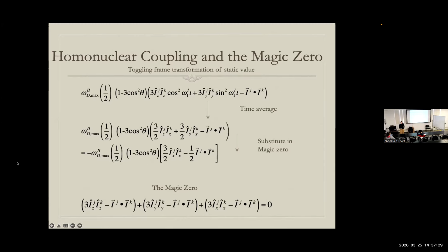So you have 1, 2, 3, maybe 4 spins that all recouple. But when you go to many, when you go to Avogadro's number, it behaves dissipatively. And why? What's happening there? You lose into the larger network of spins things that don't fully recouple in the second half of the rotor cycle, if you think about the slow spinning limit.